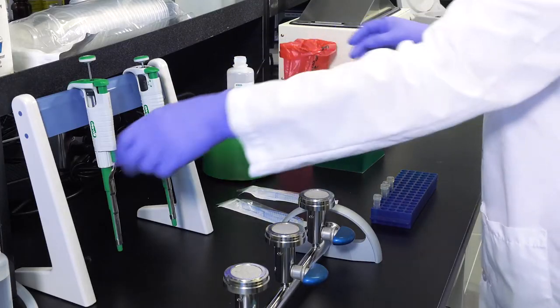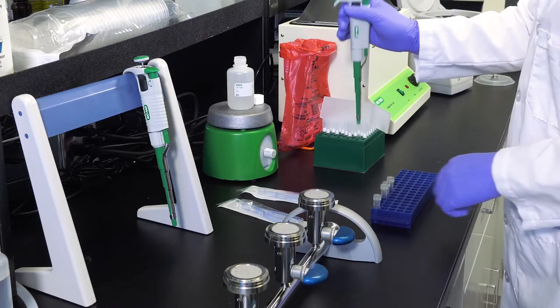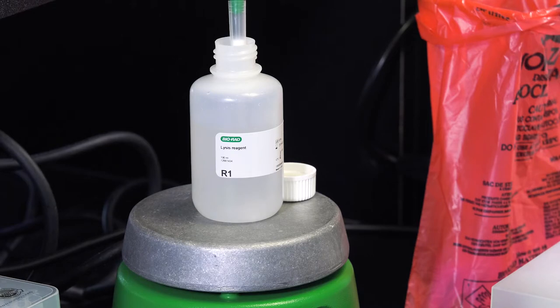First, pipette one milliliter of R1 solution into a two milliliter screw cap microcentrifuge tube. The R1 reagent must be continuously stirring on a magnetic stir plate.